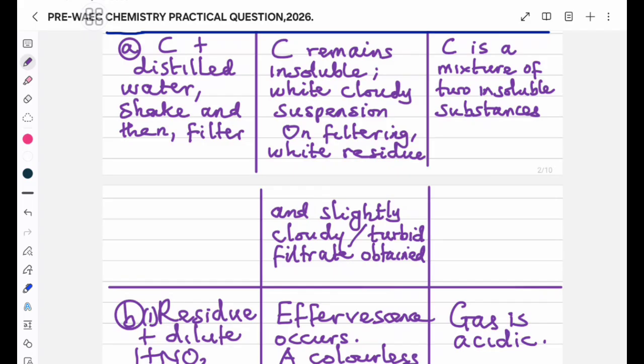That is why they come out through the filter paper. And when they come out through the filter paper, they are dispersed throughout the water, making the water look colloidal. Because some particles pass through the water but are too tiny and light to settle, they are dispersed throughout the water. That makes it look cloudy.